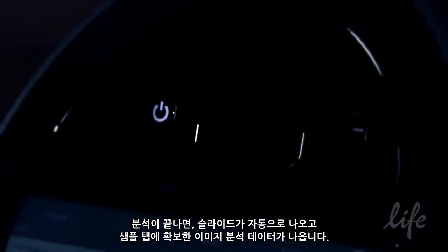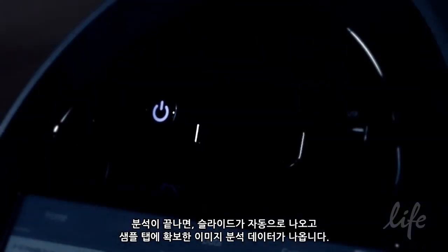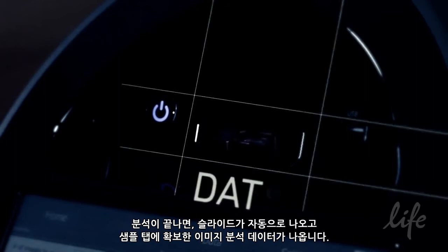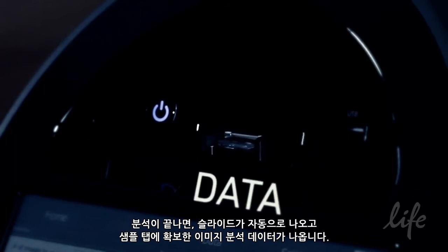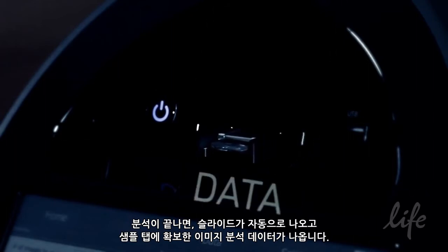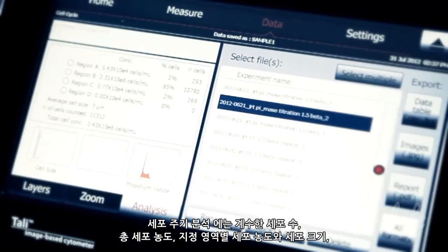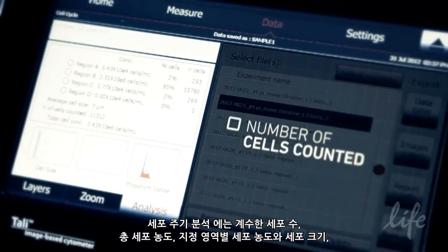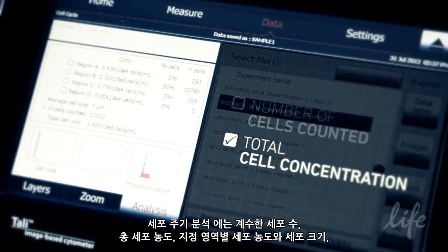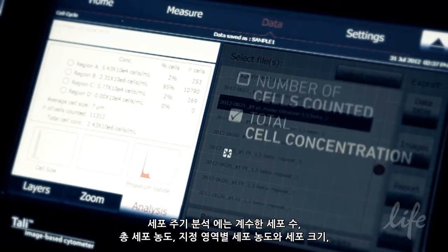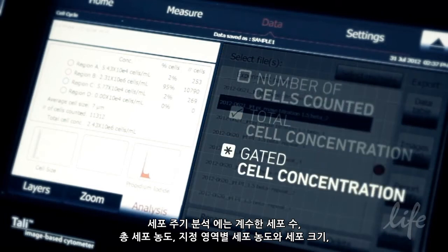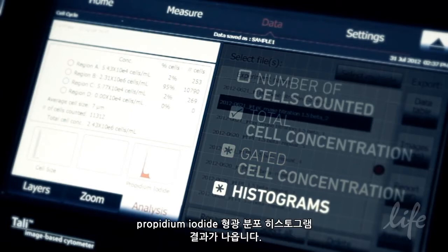After analysis, the Tally automatically ejects the slide and provides data from the analysis of the captured images in the sample tab. The cell cycle assay specific data includes the number of cells counted, total cell concentration and cell concentration within each gated region, as well as the histograms for cell size and propidium iodide fluorescence distribution.